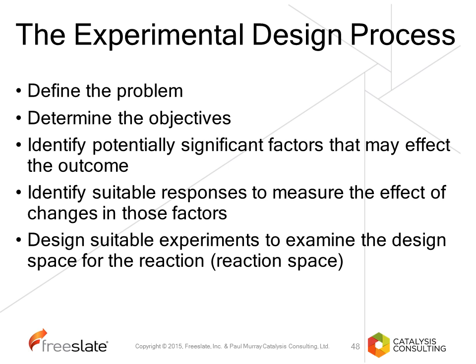So for instance, you may look to get the highest conversion that you can, and then look at the workup separately. So when you've decided what the problem and objective of the piece of work is, you then need to think very carefully about what factors you're going to investigate. And this is extremely important. And once you've chosen what factors you're going to investigate, you need to think about the ranges for those factors.